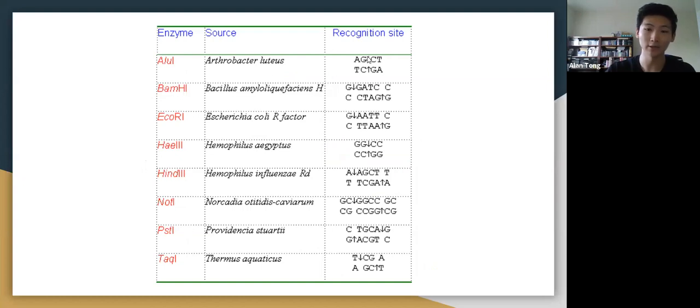So you can see how some of them don't make sticky ends, they make blunt ends, and that's actually kind of annoying because you don't get that sticky effect. They are useful in some situations, but you can see how most of them are sticky ends, right? You can see how most of them cut away from each other. Here's a blunt end one again. And they all have their own names. You can order them online if you're doing some research.